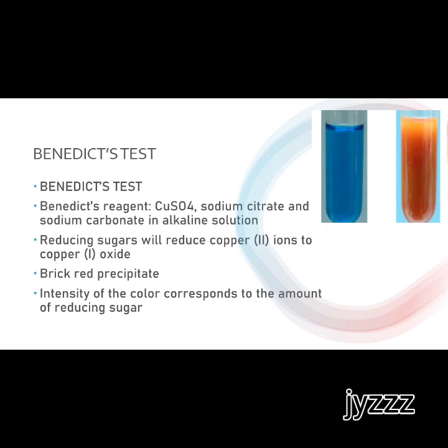One advantage for this one accordingly is that the reading for your Benedict's test can be done semi-quantitatively, based on your intensity of the color.